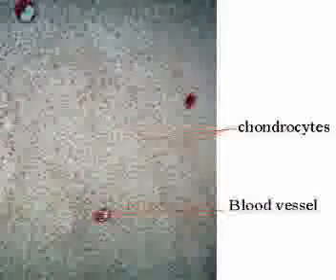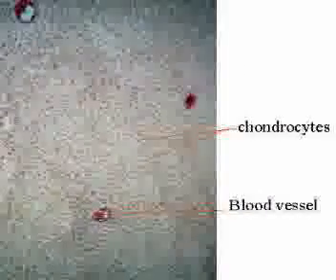Articulation of developing bones contain high amounts of cartilage.